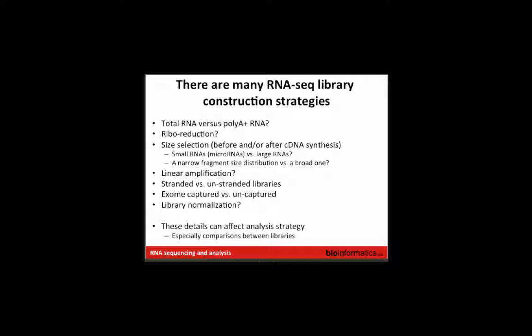And then there are other library normalization strategies. There's a lot of detail in here. The broad important thing to think about is that all of these things can affect your analysis strategy, especially if you're comparing between libraries. So you don't want to vary any of these things between the libraries that you're ultimately going to be comparing to each other, as much as possible.